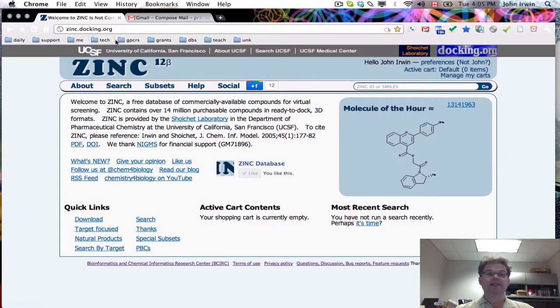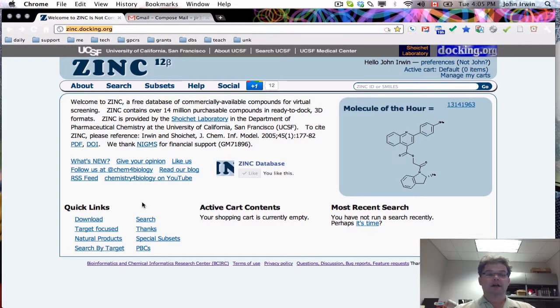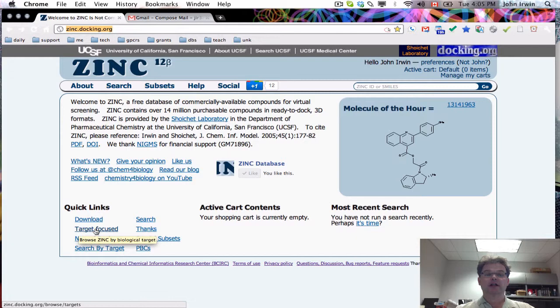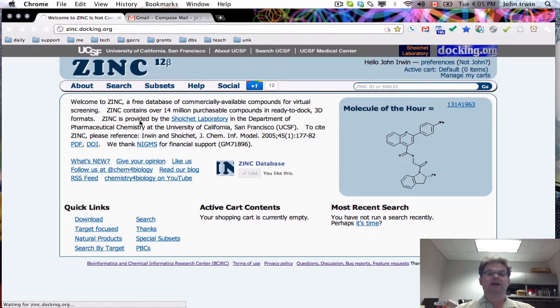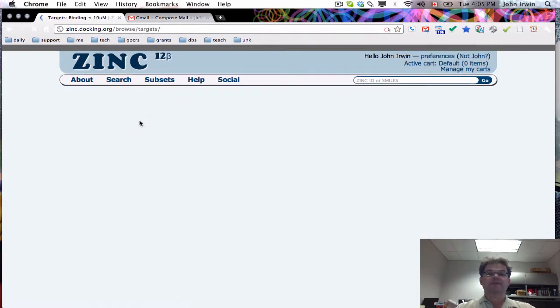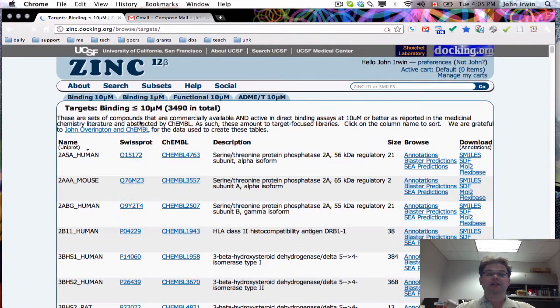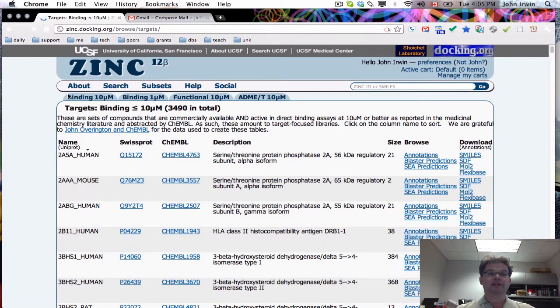We're going to be at zinc.docking.org. We have a link right on the front page, target-focused libraries. You can also go to subsets, targets. It's the same link. And when we do that, you can see there are four tabs here.